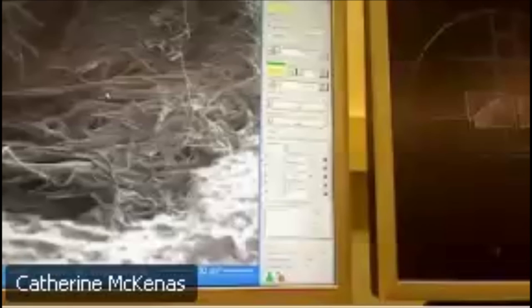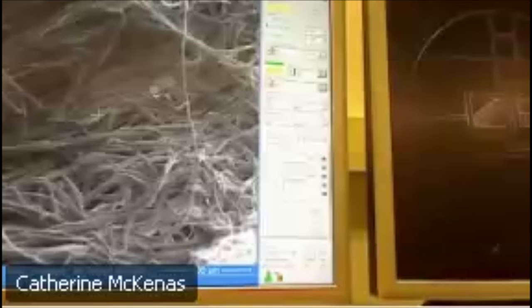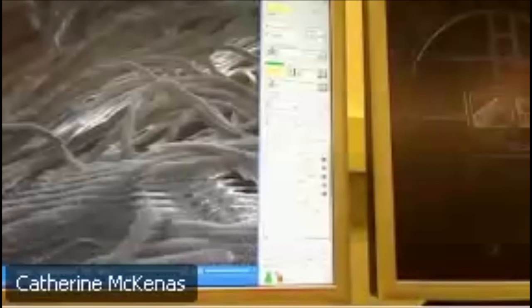Okay. Has the top layer been removed? Is that what we're looking at? I put it on the stage so that we can look straight down at a cut of it. So we're able to look at a side view of the lichen. And so this is the second layer, and you see just a ton of long fiber things. This is, again, more loosely packed because this is where the fungus is living. And so we really need to allow here for the flow of air. So we'll take a picture of this for y'all.